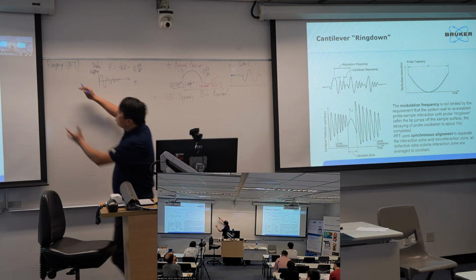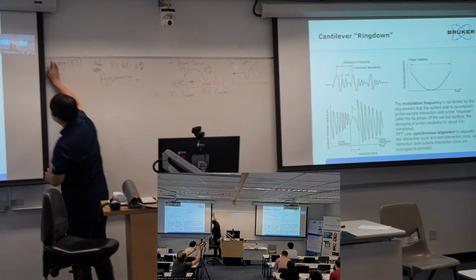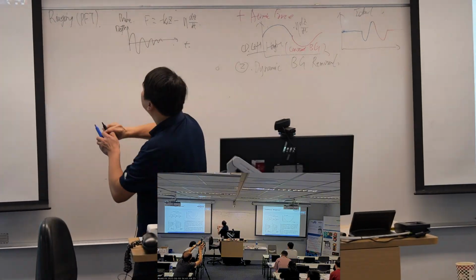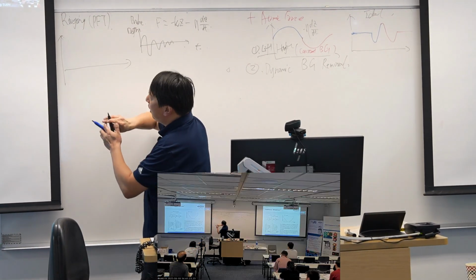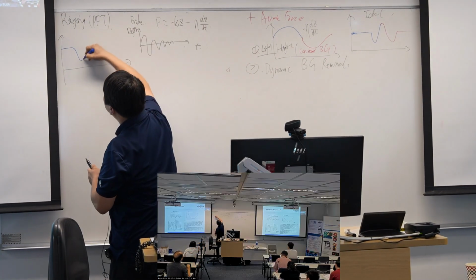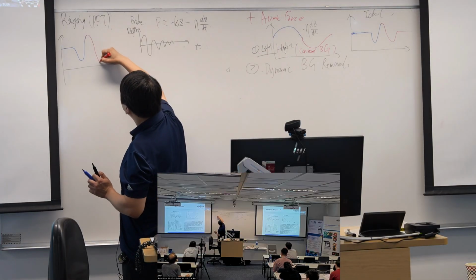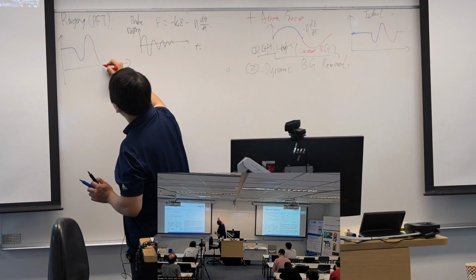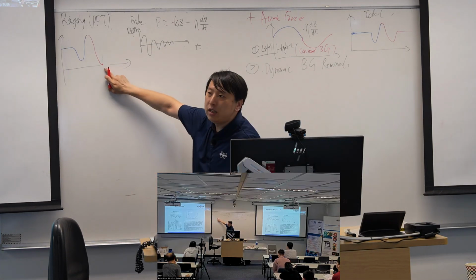So when we do a force curve, we reach this bottom. This is the adhesion force.